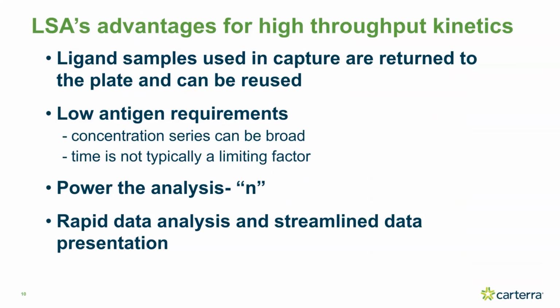Also, because all of the data is being collected in parallel, time is not usually a limiting factor. Most kinetic assays are run overnight and are completed by early morning the next day at the latest. So you don't find yourself making very many decisions in terms of limiting the number of concentrations or designing the assay to reduce the time. You really design them based on the way you want your data to look.